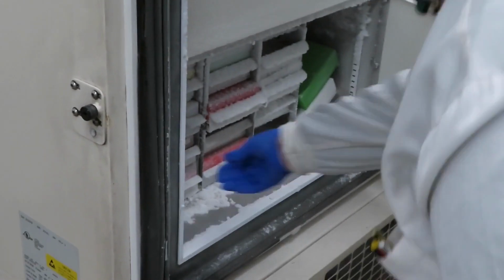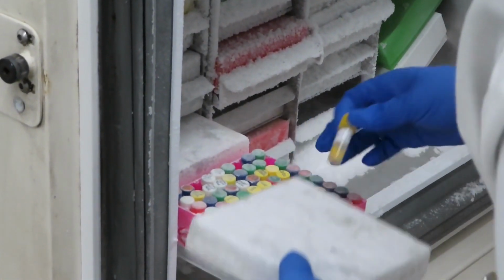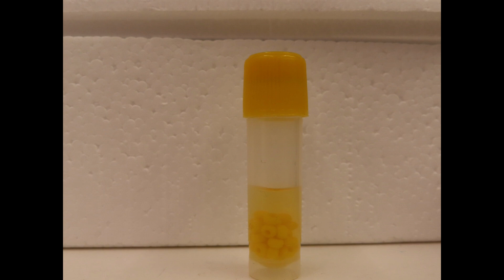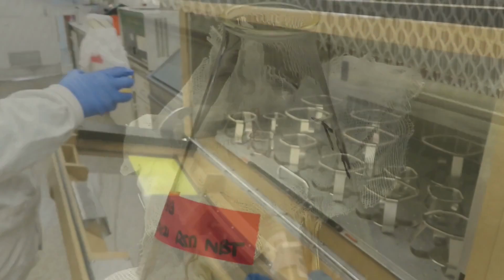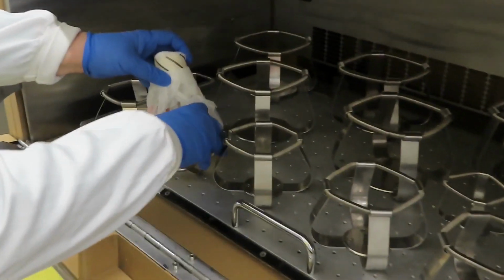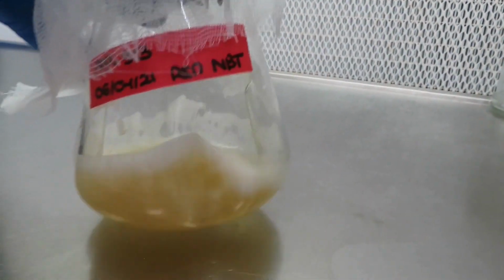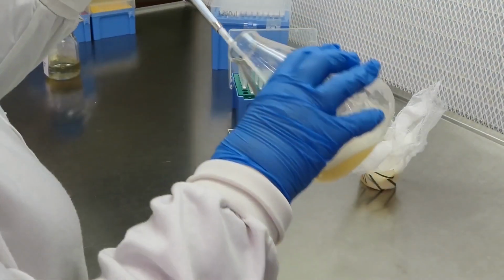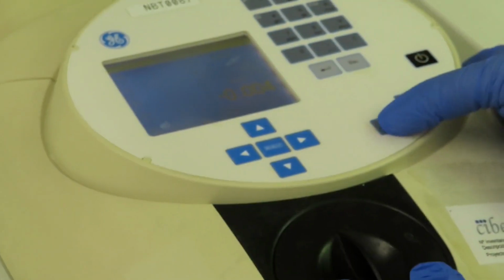The bacteria containing the plasmid with the transgene of the protein to be produced are stored at -80 Celsius degrees. The frozen bacteria are attached to these small beads, and it is enough to add one of them to the culture medium. The flask is incubated overnight under agitation at 37 Celsius degrees. The next day, an evident bacterial growth can be seen in the pre-inoculum. The level of growth is determined by the optical density of the sample at 550 nanometers.